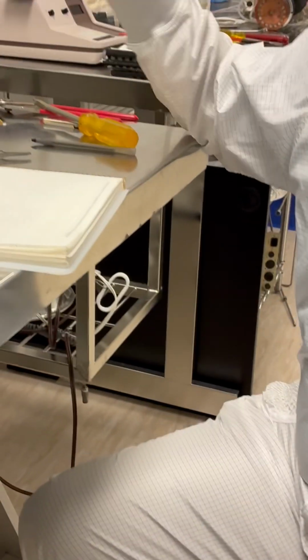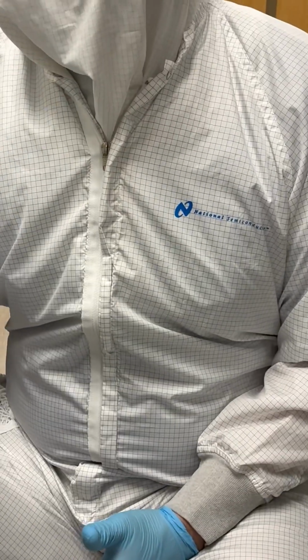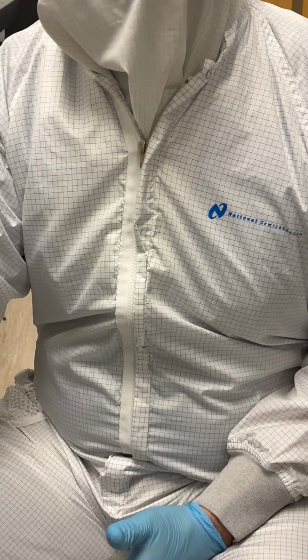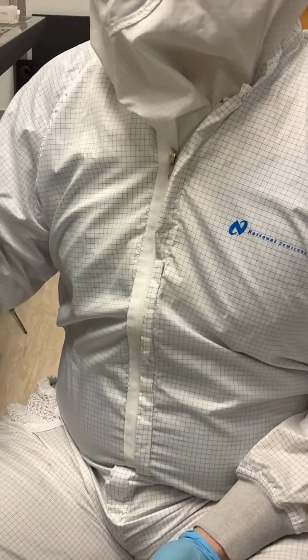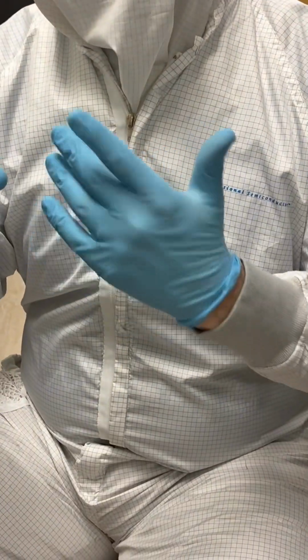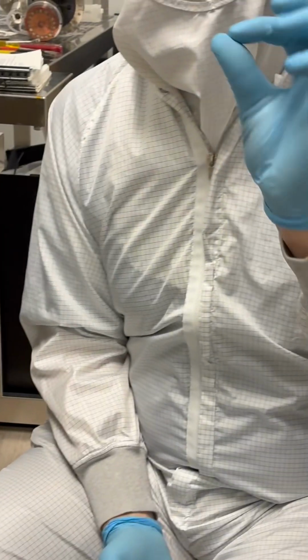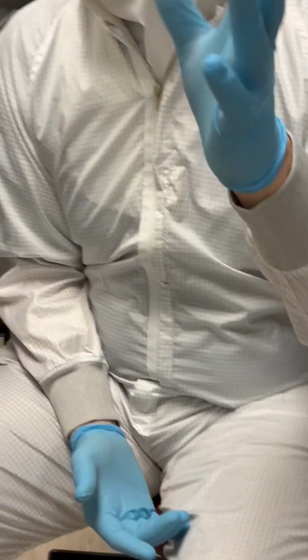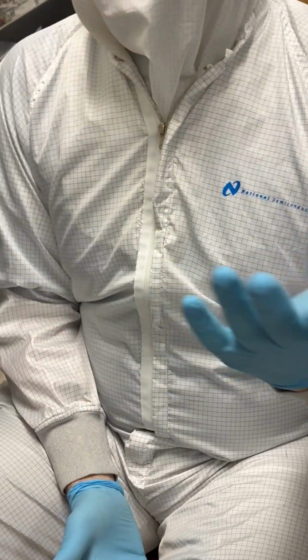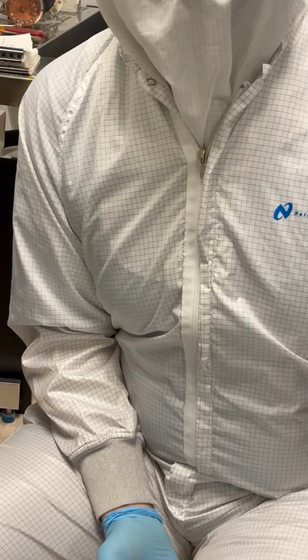But if plus or minus 10% is good enough for you, and I'm not saying plus or minus 10% every time, I'm just saying that the actual versus what you grow could be different by 10%. You should do that calibration. But if you're able to accept that difference, I'd recommend just going with it. And so for your platinum growth, that really thin one, I'd recommend doing AFM because your thickness is a really important variable to know. But at the end of the day, if you grow 4 nanometers versus 5 nanometers, both will probably work for your process. You just want to know what it is, right?